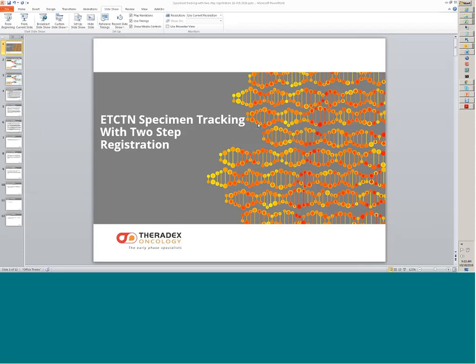ETCTN specimen tracking with a two-step registration. The focus of this training is Protocol 10191, but this training will also be useful for any other future ETCTN protocols that will utilize the two-step registration process. The specimen tracking system is consistent from one protocol to the next. Of course, there are special customizations that a protocol might require, and I'll point those out as we go along.